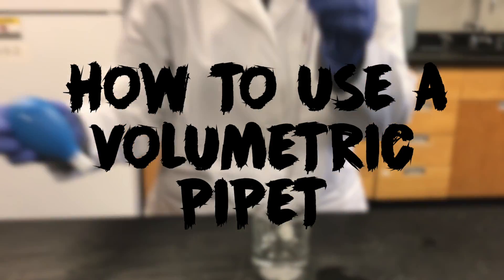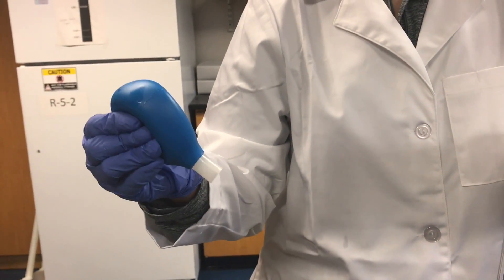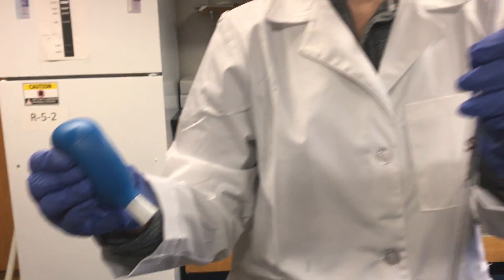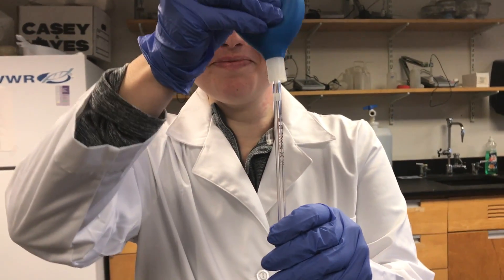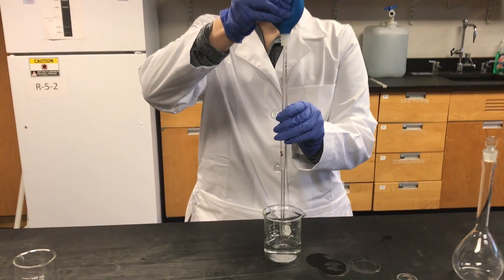Next we're going to teach you how to use a volumetric pipette. First you're going to squeeze the rubber bulb and then place it on top of the pipette. Next lower the pipette into the liquid and slowly release the bulb.